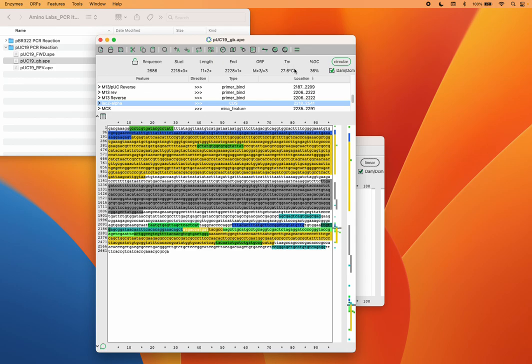And so when we're doing a PCR reaction, you might remember that in phase 2 of the reaction, there is a step called the annealing step. And that annealing step temperature is correlated to this melting temperature of your actual primers. Okay. We want to strive to get about 60 degrees Celsius. That's a pretty good melting temperature in general for primers.